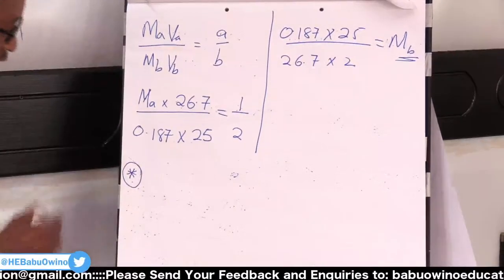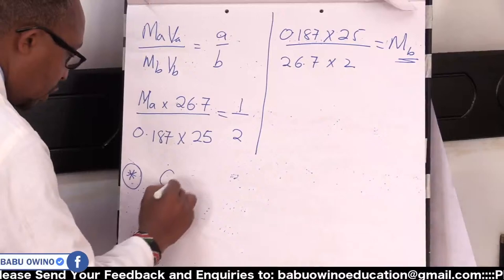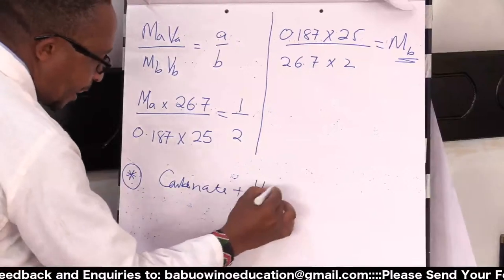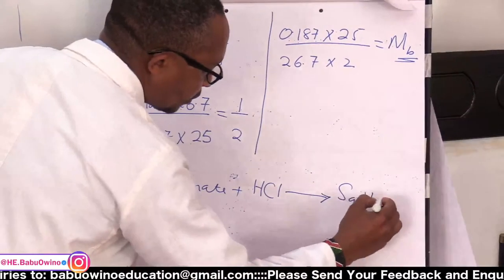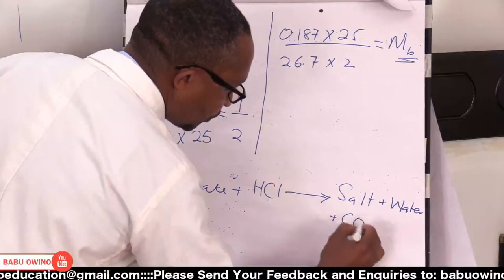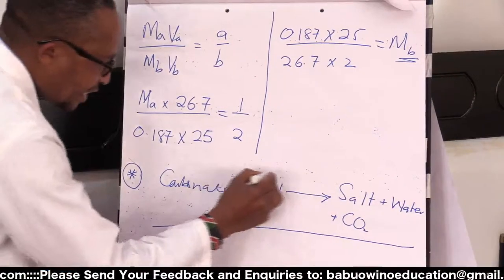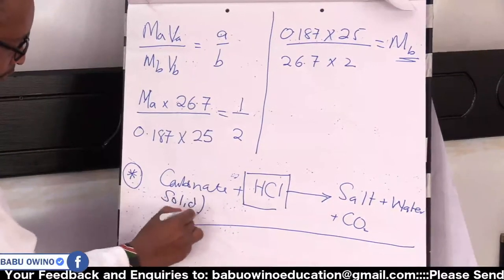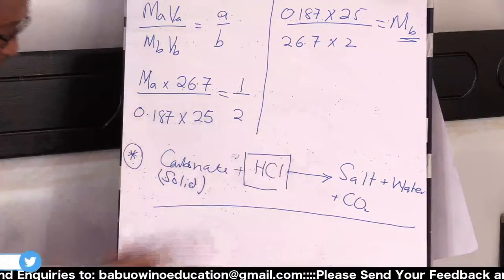The same examiner may give you another question. And this question is, you take a carbonate, you react it with an acid, say HCl, then you will get a salt plus water plus CO2. And then you are given some solid. Then you are told to put it in the acid and stir.